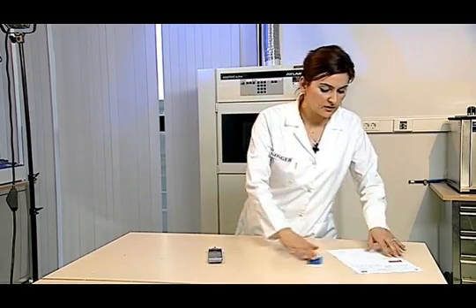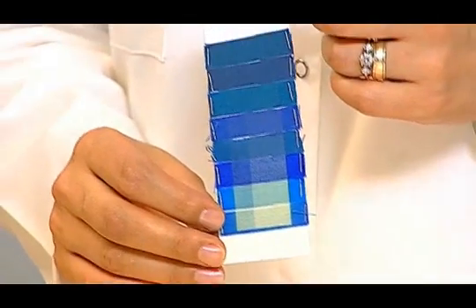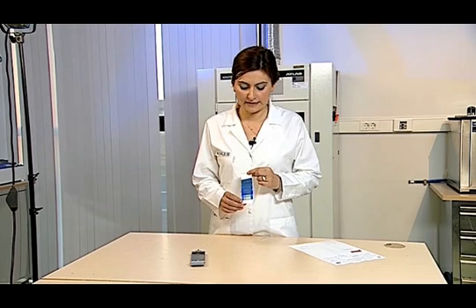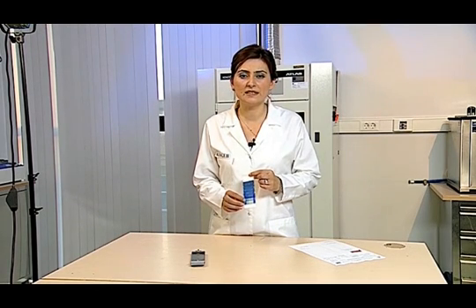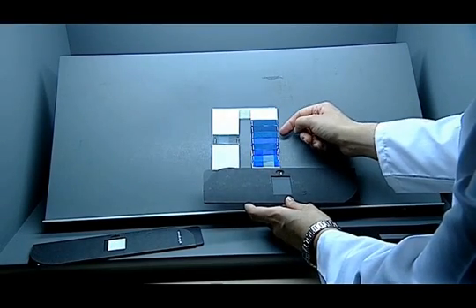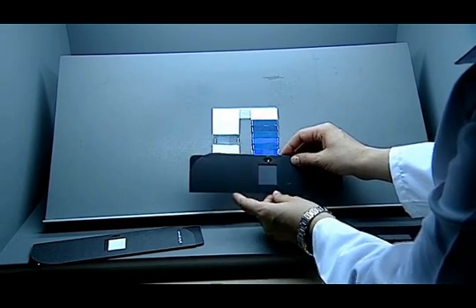Whether the humidity is 40% or not is checked by a red moisture control light. The test is ended when four equal discolorations occur according to the blue wool scale, or upon the customer's demand. When setting the time period, it is expected that each blue scale will fade in a period twice more than the previous one. The test is terminated when a fading equal to number 4 on the grey scale occurs on reference blue wool number 6.